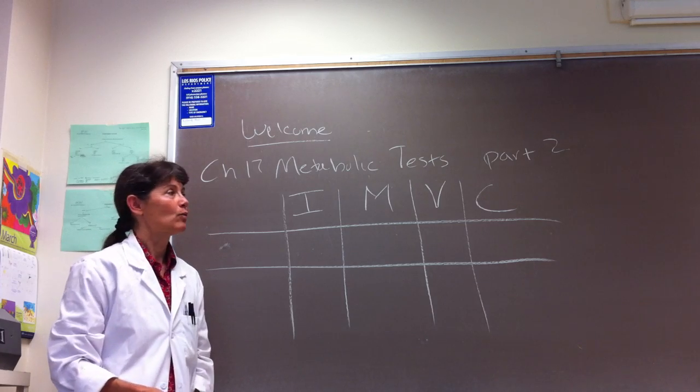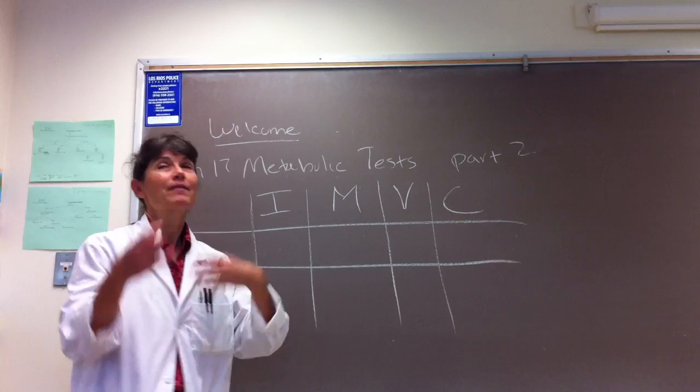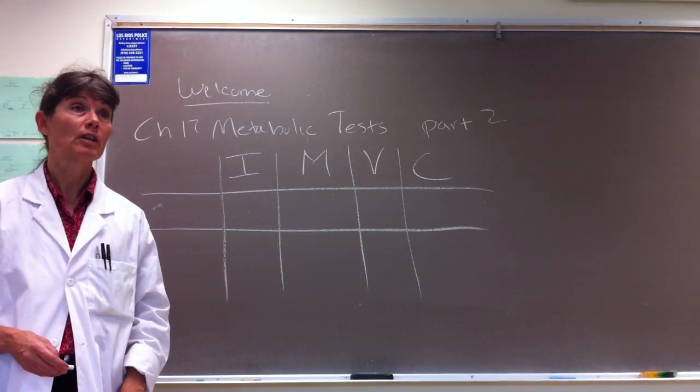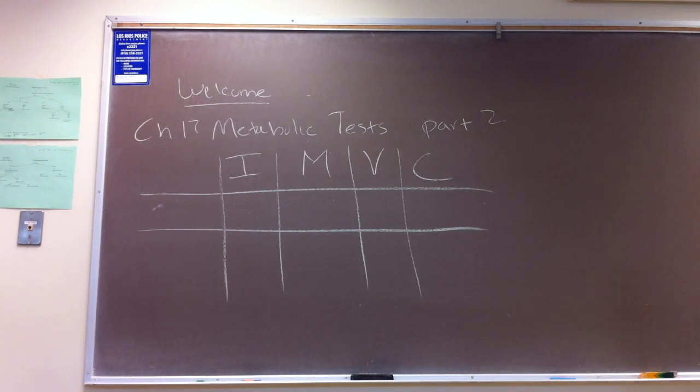So we want to explain why this series of tests was developed. We have to go back to our whole great concern with fecal contamination of drinking water and food. If we have fecal contamination of food or drinking water, possibly a great variety of enteric pathogens could be present.